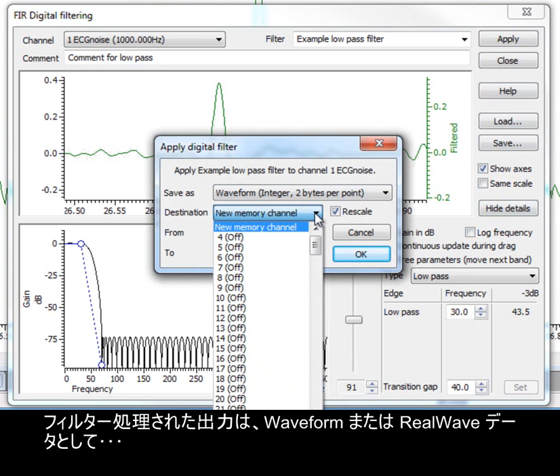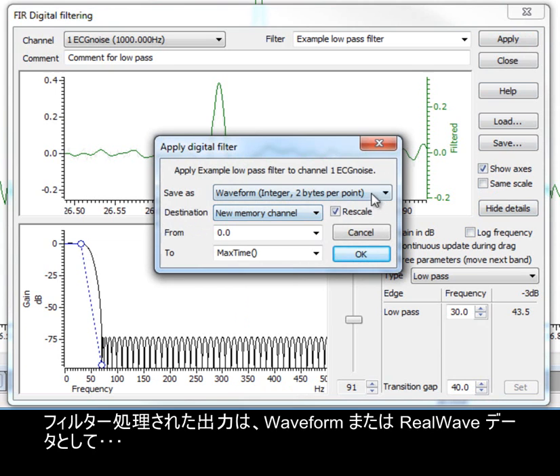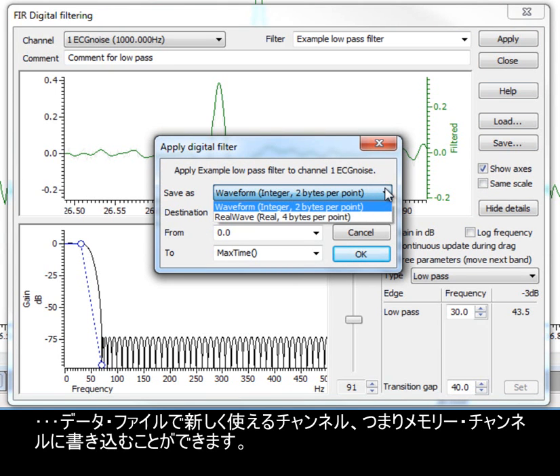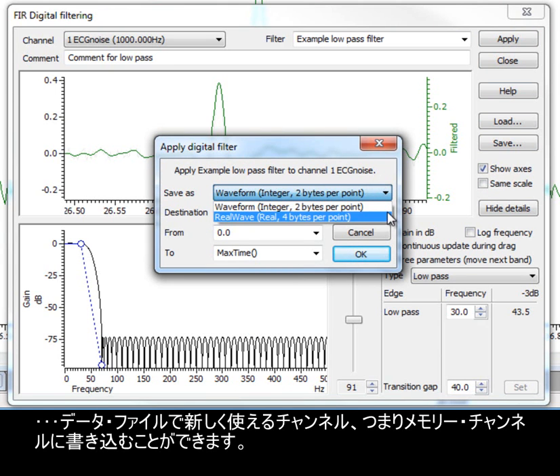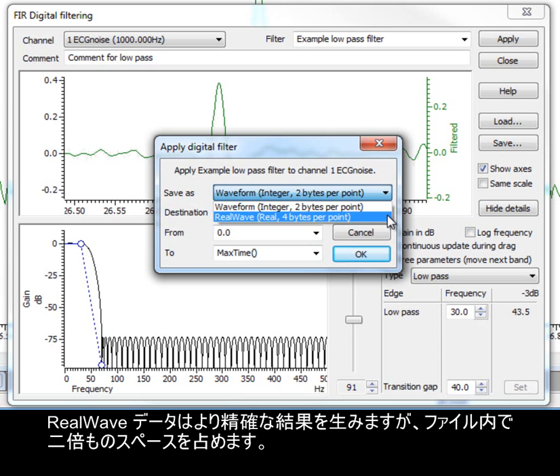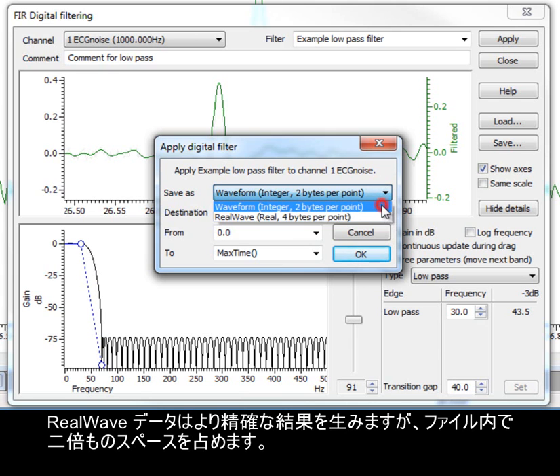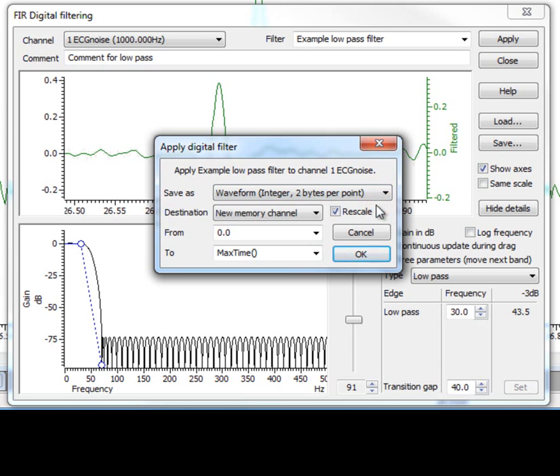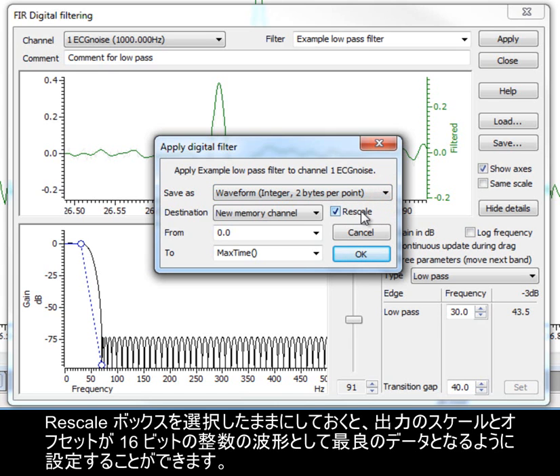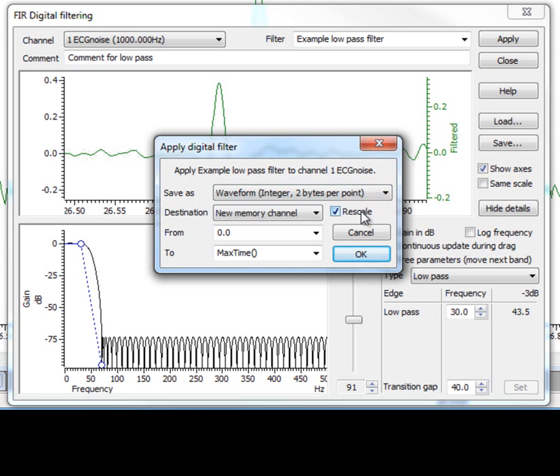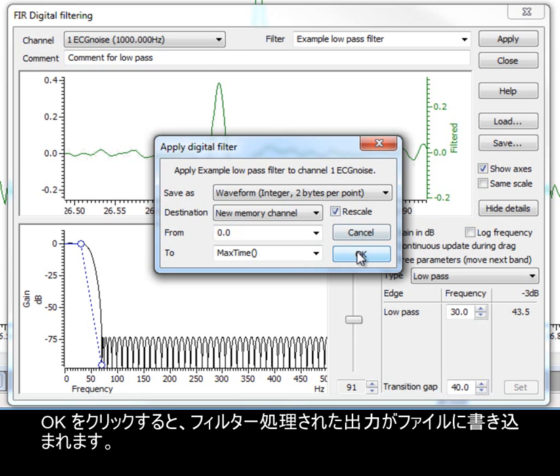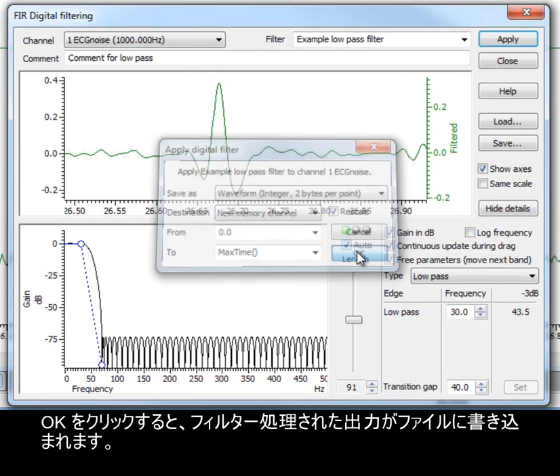Filtered output can be written to a new, free channel in the data file, or a memory channel, as waveform or real wave data. Real wave data gives a more accurate result, but takes up twice as much space in the file. Leaving the rescale box checked sets the output scale and offset to give the best representation of the data as a 16-bit integer waveform. Clicking OK then writes the filtered output to the file.